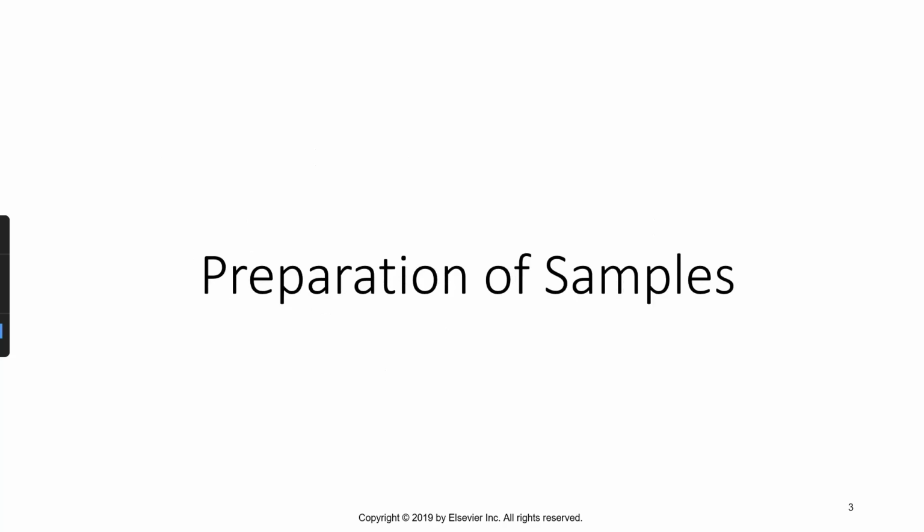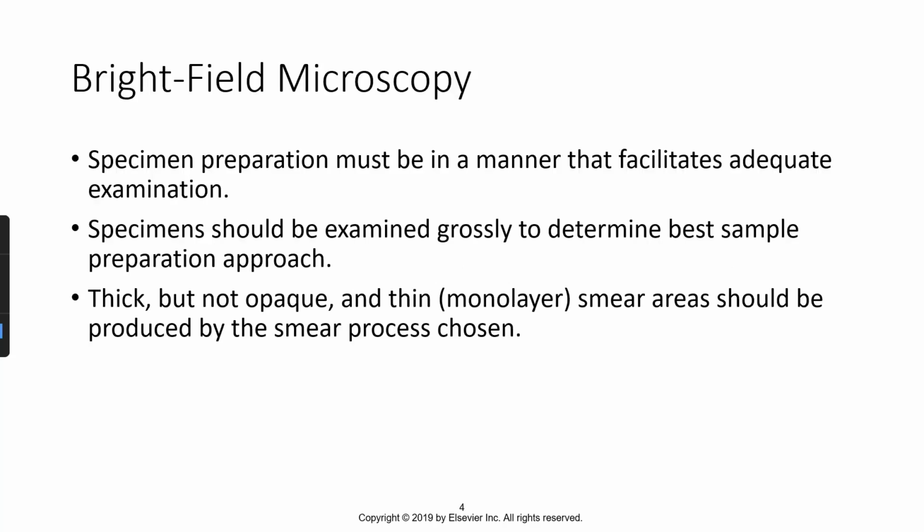So the preparation of samples. Bright field microscopy: specimen preparation must be in a manner that facilitates adequate examination. Specimens should be examined grossly to determine the best sample preparation approach. Thick but not opaque and thin monolayer smear areas should be produced by the smear process chosen.